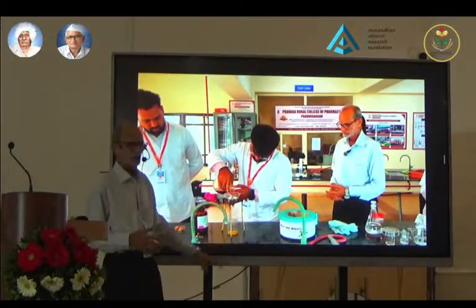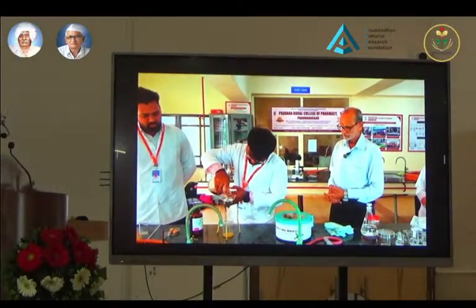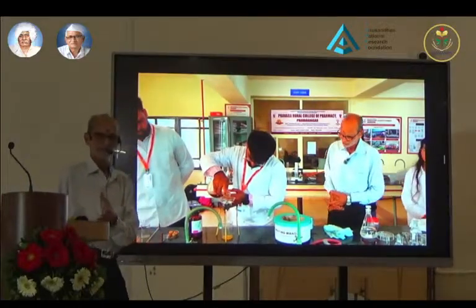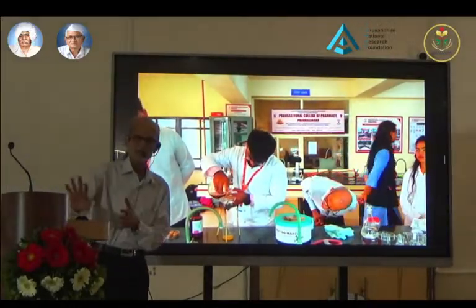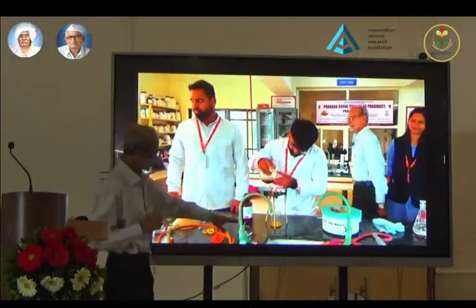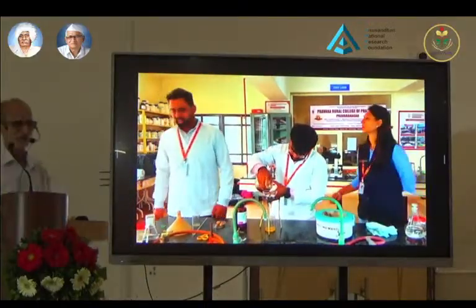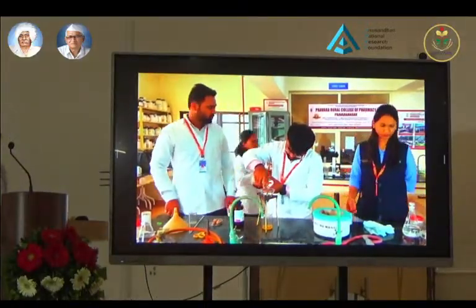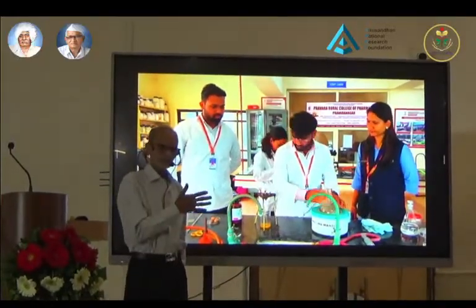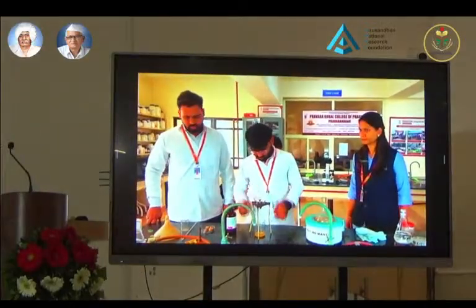So here we have a chloroform extract of nutmeg, which has trimyristin as well as other constituents, primarily volatile oil. But we want only trimyristin and not the volatile oil constituents at this moment. This is the filtration. Afterward, this will be concentrated. After concentration, it is treated with acetone, and acetone dissolves all the impurities, and trimyristin, which is not soluble in acetone, is separated in the form of a white amorphous powder.